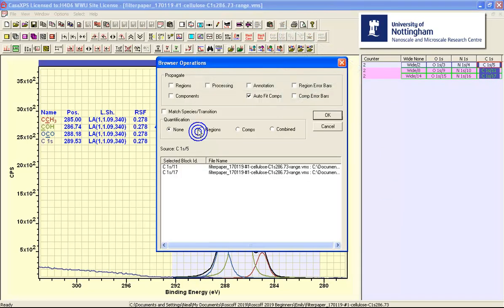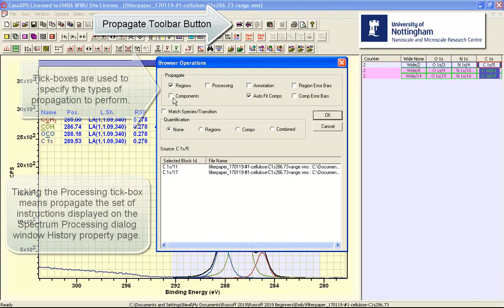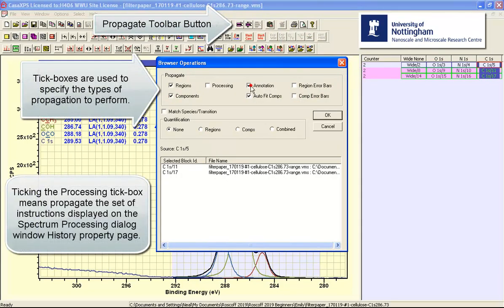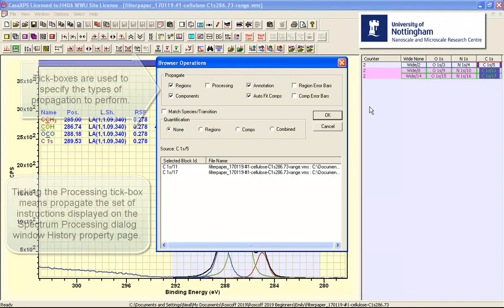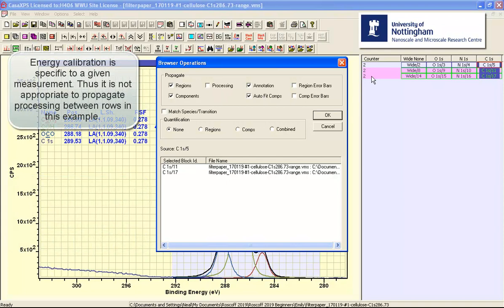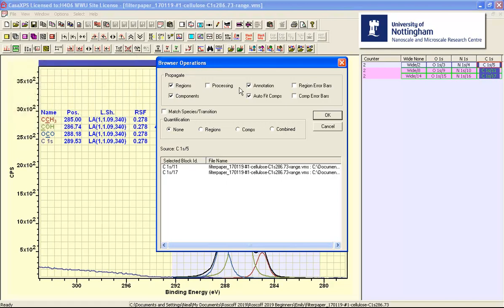Right-click over the displayed data with the peak model, select the regions, components, annotation, not processing because processing includes the energy calibration, so we have independent calibration for each row. So we do not wish to propagate processing, but we do want to propagate regions, components, annotation, and also auto-fit.